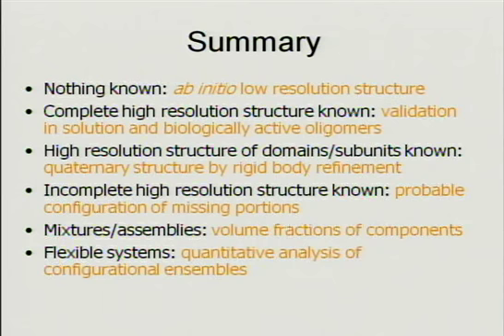And if you have an incomplete structure of your protein, you can add the missing linkers using the programs Bunch or Coral. And besides, SAXS is probably the only method where you can really characterize unfolded proteins. And unfolded proteins are about 30% of all proteins.